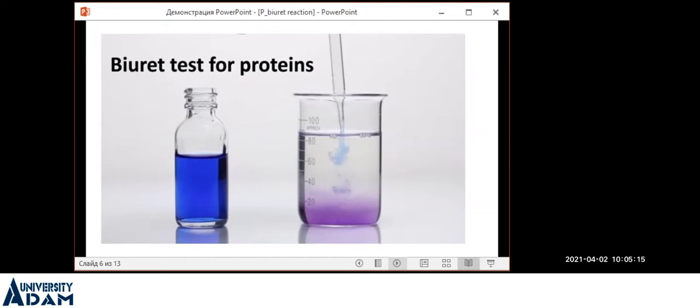Okay, and what else must we remember about this reaction? Let's see some video about what this Biuret reaction means and how it can be recognized and organized for research of protein in the solution. For this reason, I recommend you come to our Moodle platform.